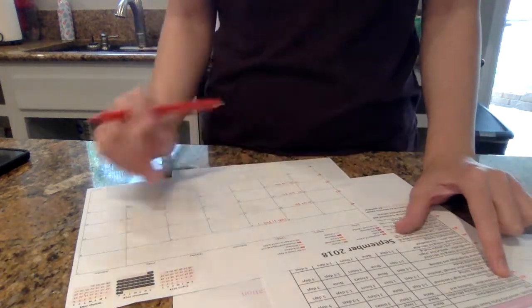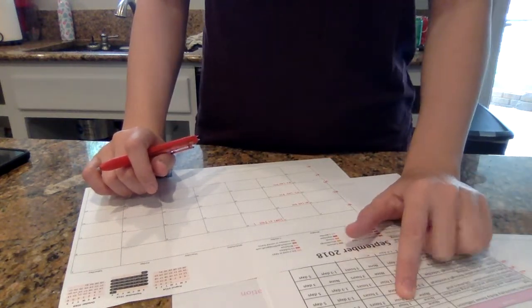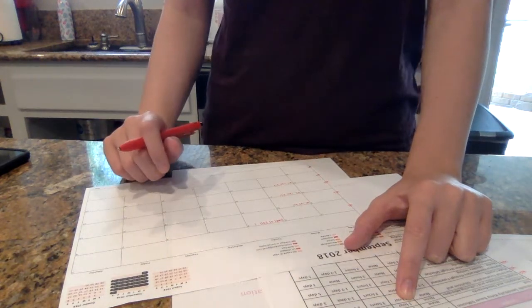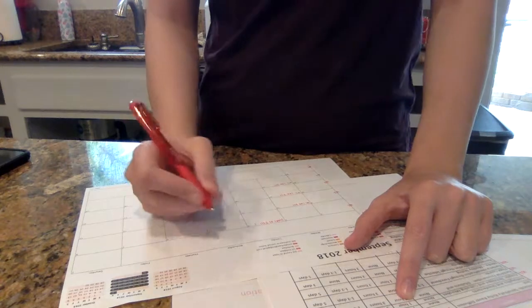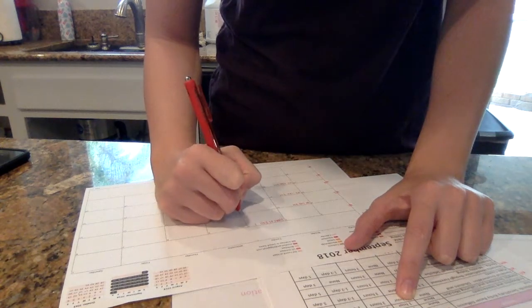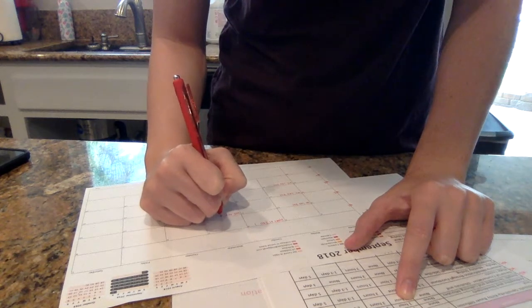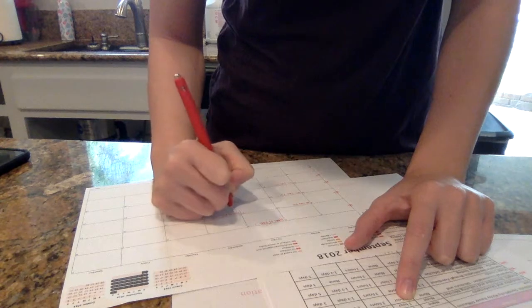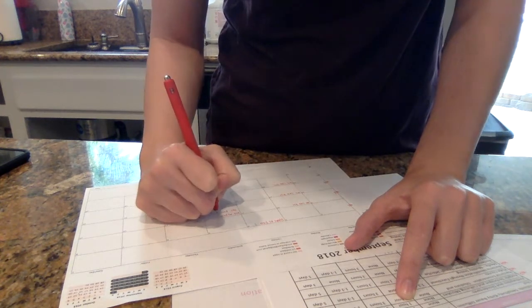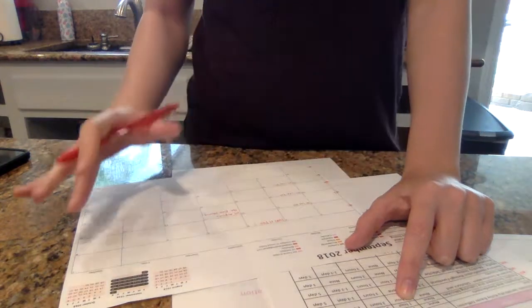So for week 2, the aseptic technique in culturing microbes, there's no active cultures and there's 1 hour of plate pouring. So I'm going to decide to go ahead and start on a Wednesday. For the week 2 aseptic technique, there's 1 hour of plate pouring, so I'll fill that in on a Tuesday.